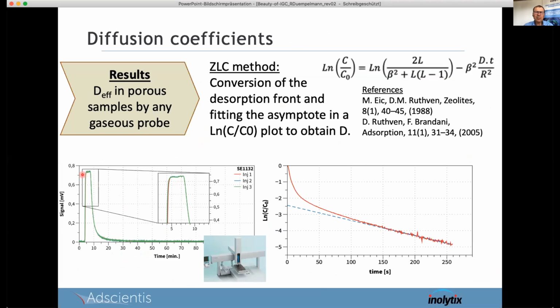So the feeding of the probe in a small concentration is really possible also using the syringe equipment with the automatic sampler. And you see here actually 3 curves on top of each other, or actually you hardly see anything on top of each other. That's the way how reproducible it is.